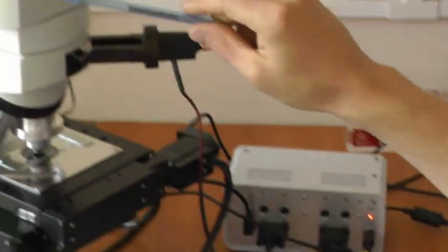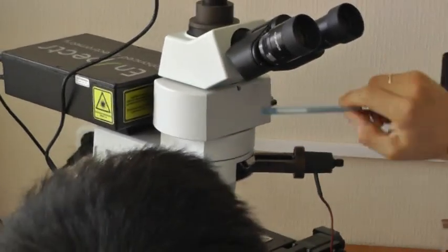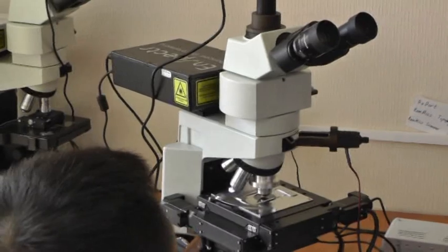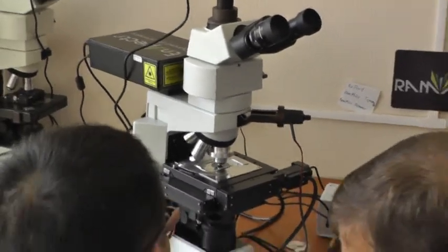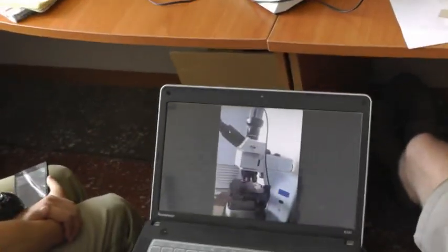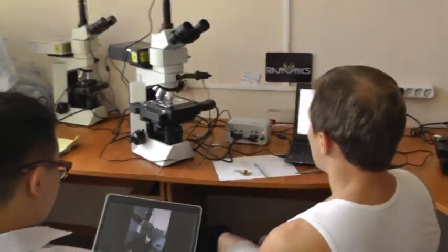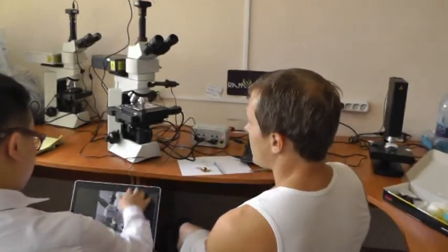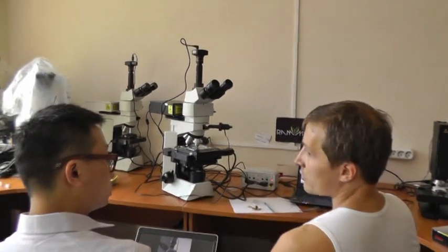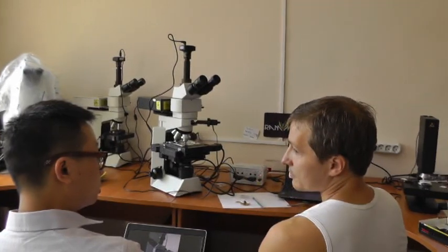As you see in this model, we can detach the trinocular module from the beam splitter and from the microscope frame, and I believe in the BX41 we also have a similar construction. That should not be a problem. I also know that the BX51 we once modified, a BX51 microscope of Olympus, and there was no problem.